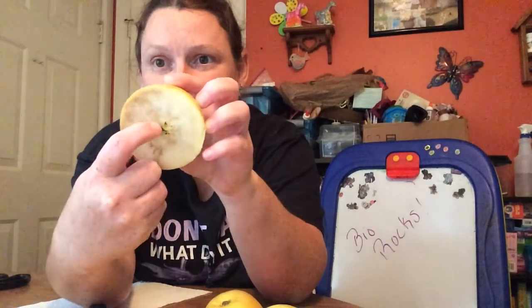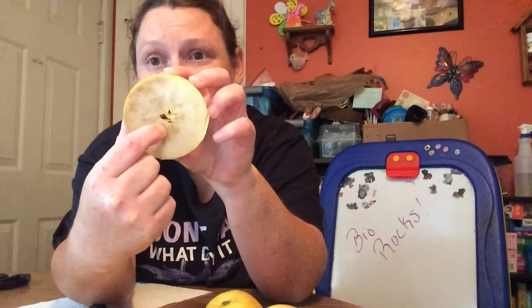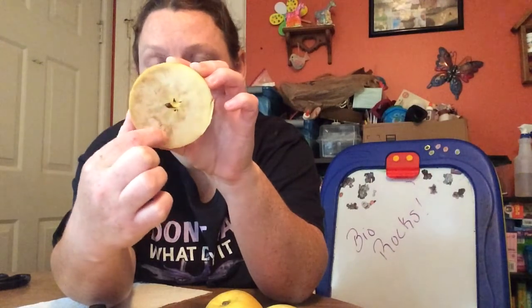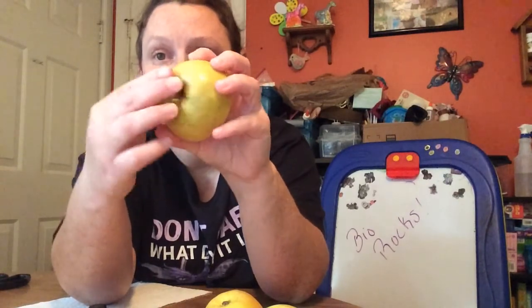Okay. So, and remember, the inner portion, that core, is developed from our ovary. The outer portion is part of the receptacle, so this fleshy part that we like to eat. And then the skin is that tough outer protective layer. And the stem is a woody structure that allows it to attach to a branch.